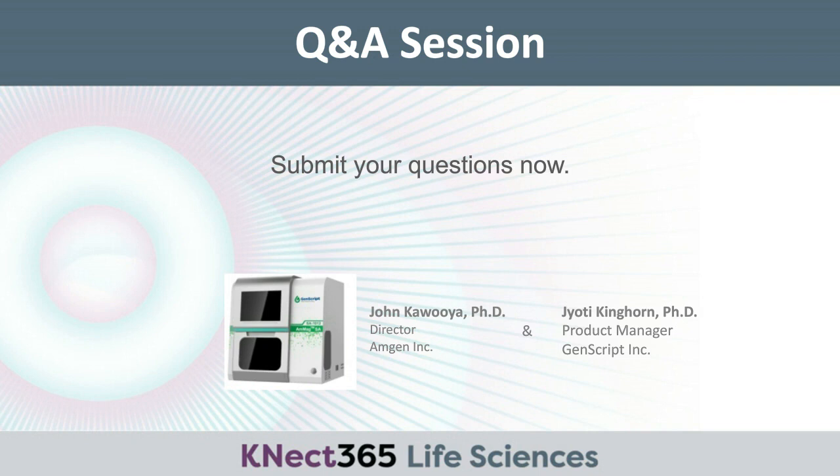Great. Thank you both for that. Another question: what is the protocol for stripping and reusing the Ni plus beads? Is a protocol available? We can send you the protocol for regeneration of beads, yes. It's available. So you guys will follow up on that one.